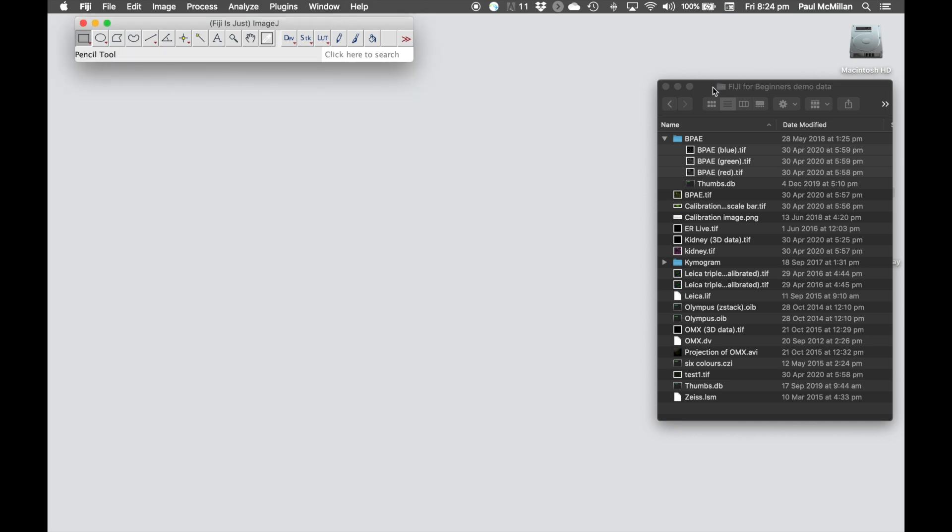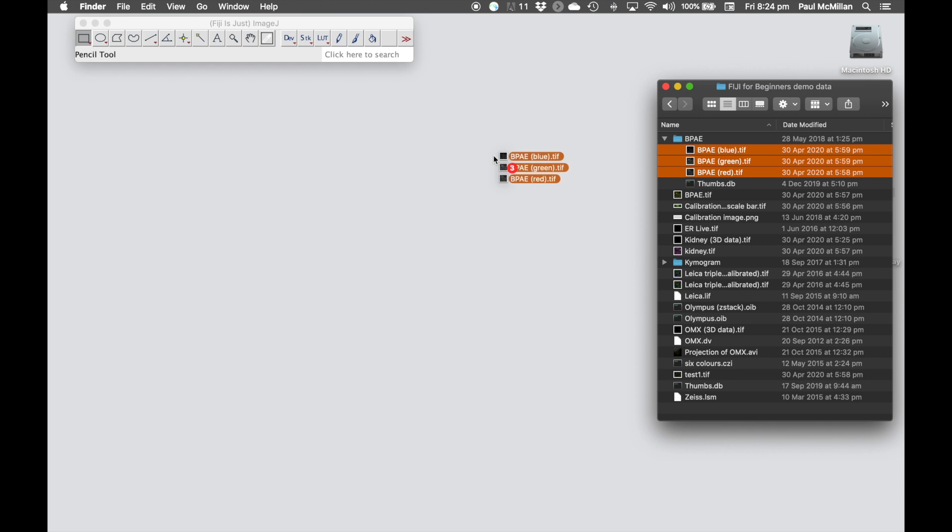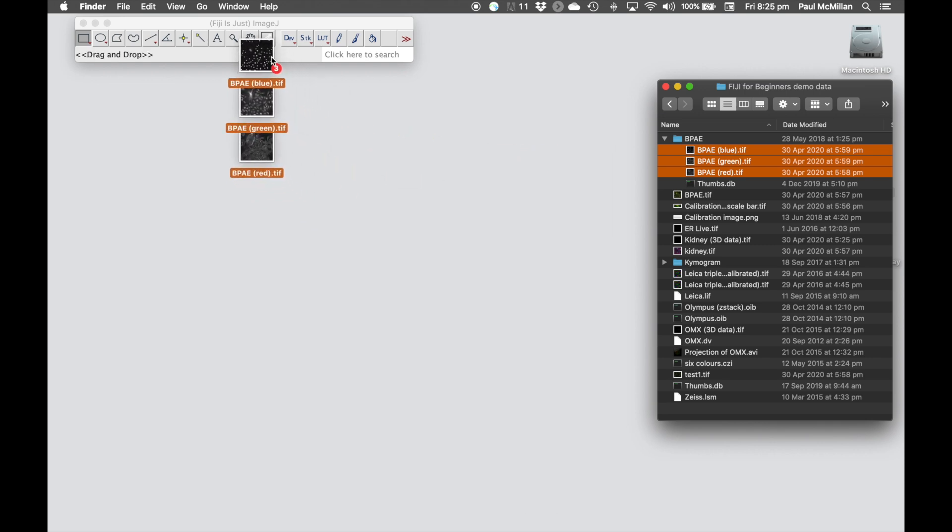Next, we're going to learn how to apply the same region of interest to multiple images. For this example, we're going to open up the three different channels from the BPAE folder.